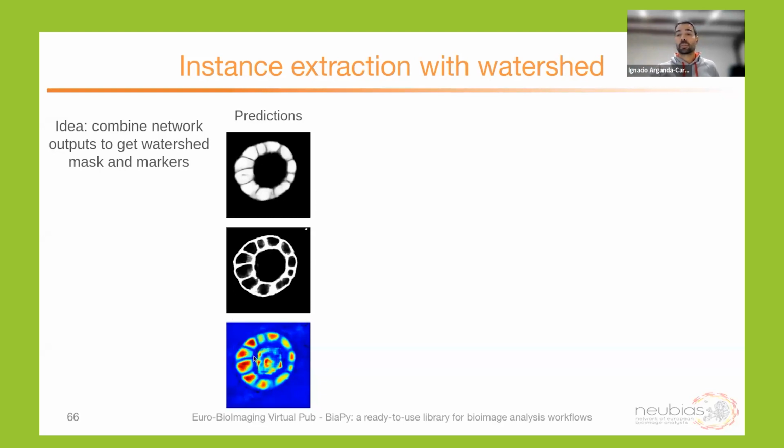It could be, for example, the regular distance to the borders, which, again, is not perfect. You see that inside the cyst, in this case, there are some distant values that shouldn't be considered. But still, the representation is quite good in the cells.